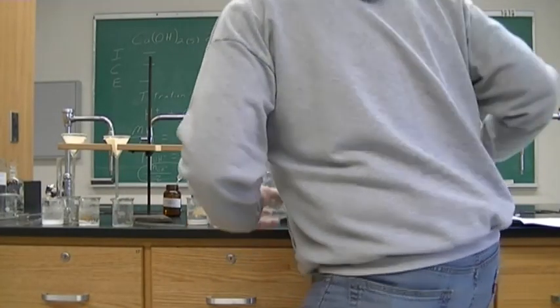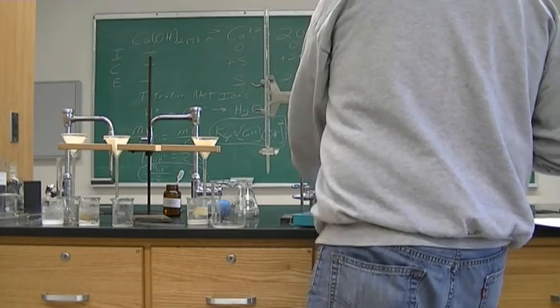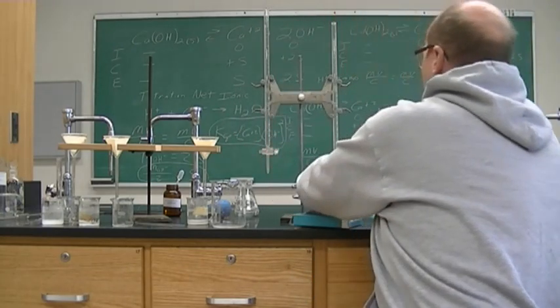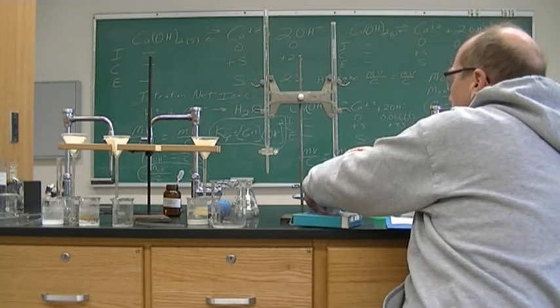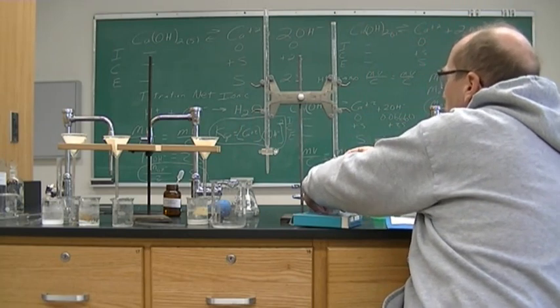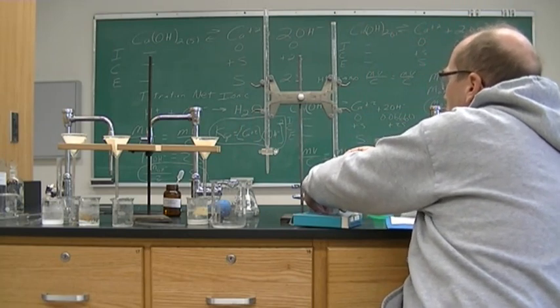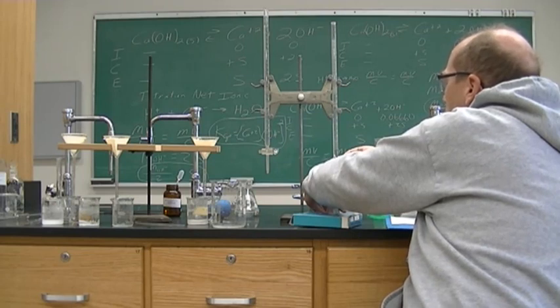All right, we're going to go from our 2.59, we want to go down to 12.59 or somewhere close to that. We are at 12.59.